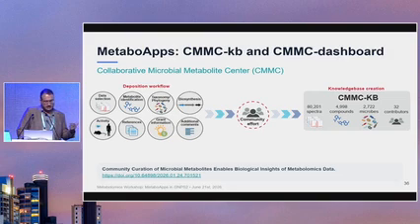You can just get in contact with them and tell them what type of studies you perform. And then you can also make your data part of the repository. But the workflow for that was basically the deposition workflow, which was basically a data selection of over 30 different researchers that work with microbial data sets.